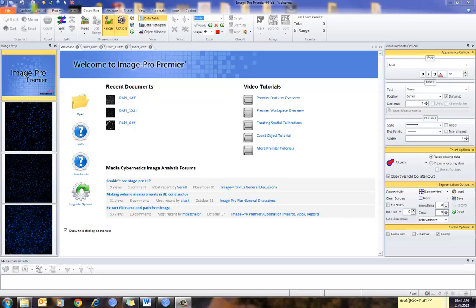For purposes of this video, I have already set up a method on how to segment and count my nuclei or objects of interest. To learn more about the count and size features, please see the related videos on count and size.